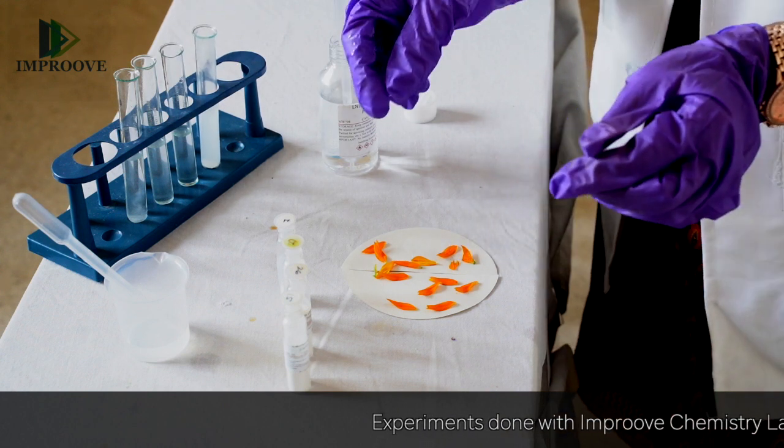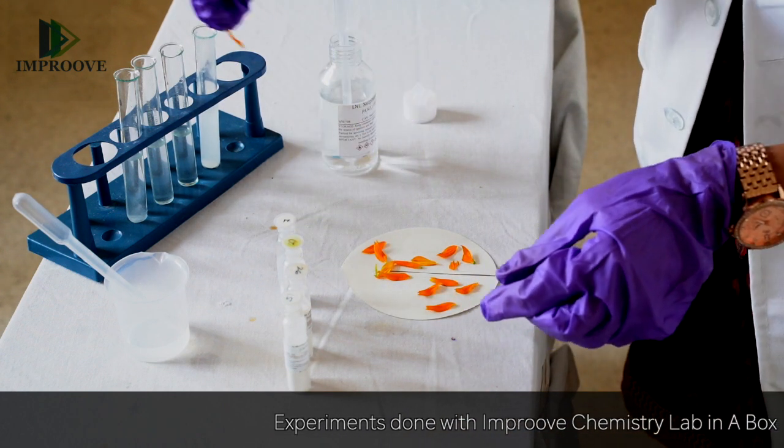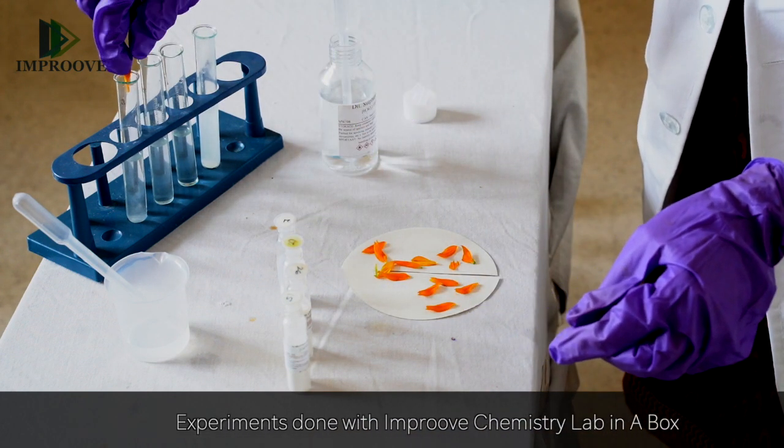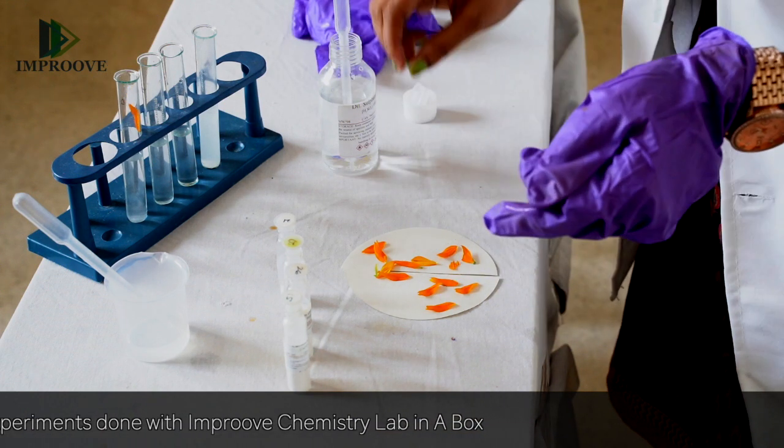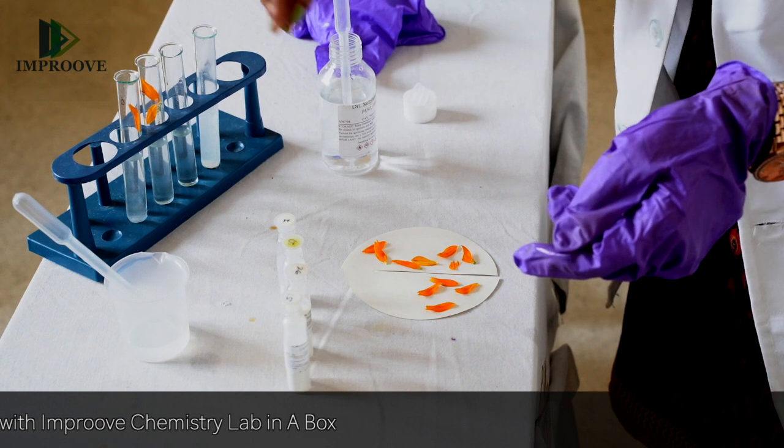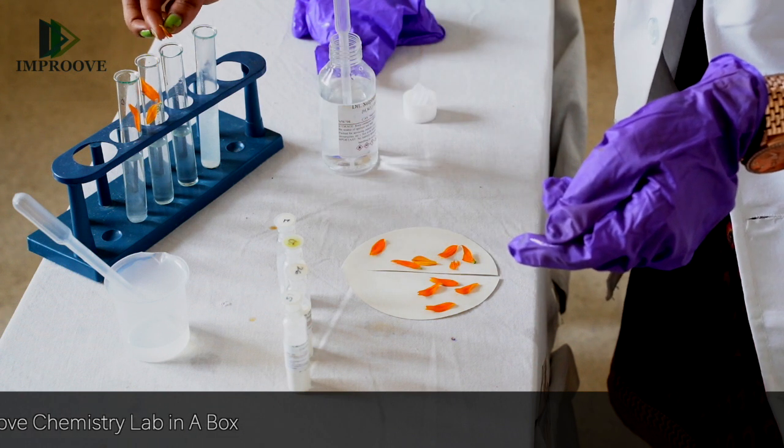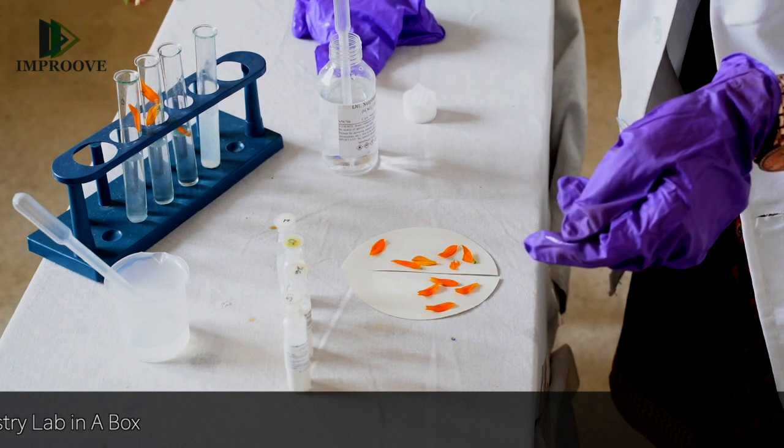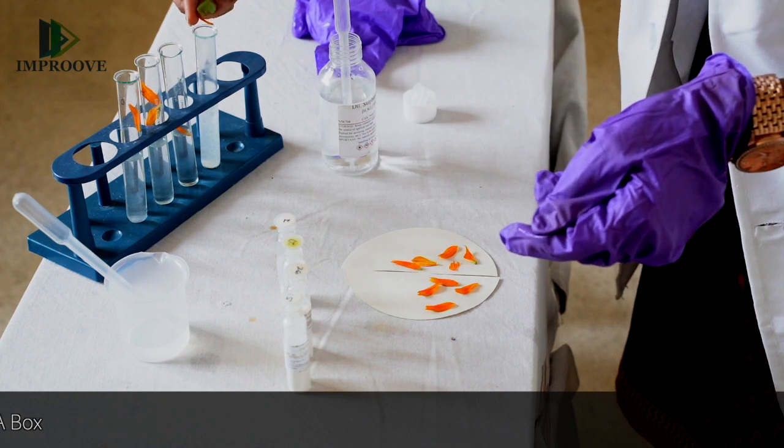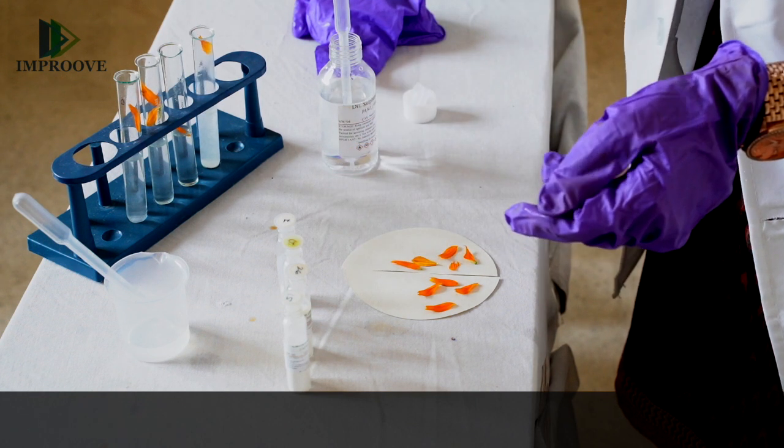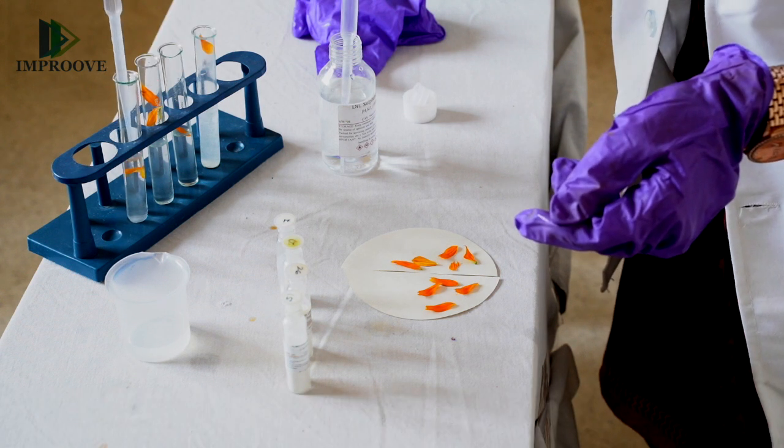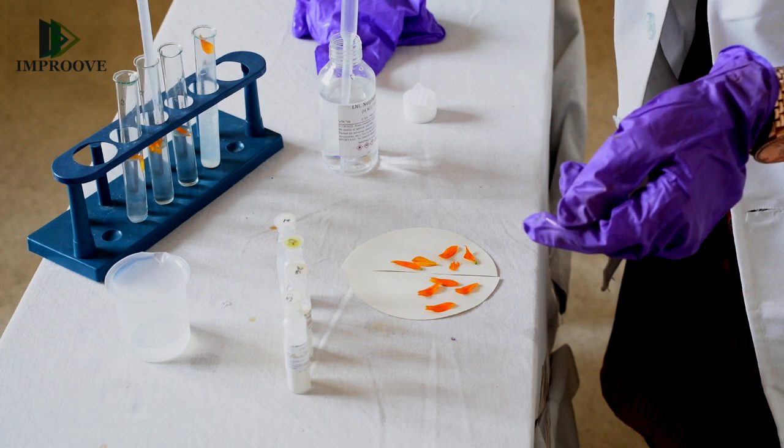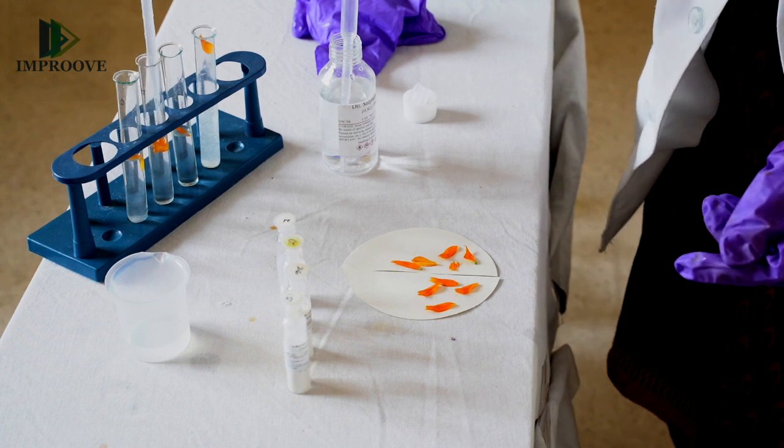Now you can carefully take a petal or two and put it into the given test tubes, preferably colored petals so that we can see the bleaching effect.